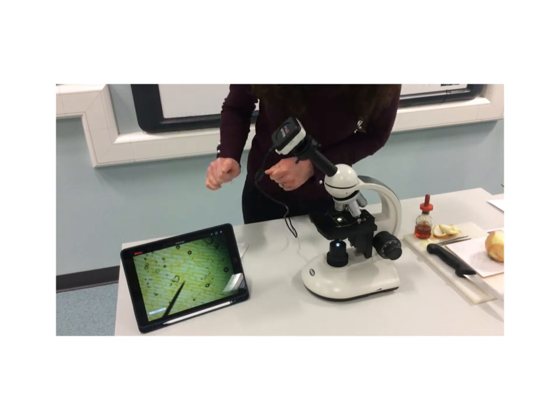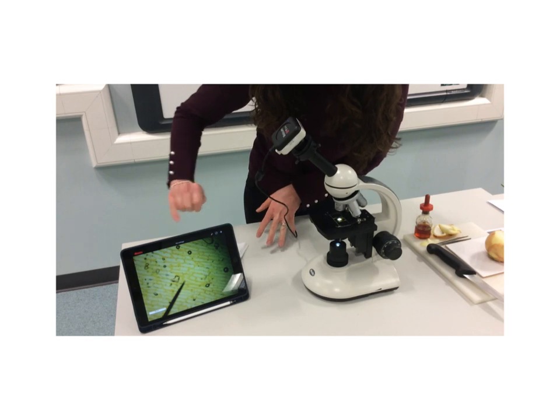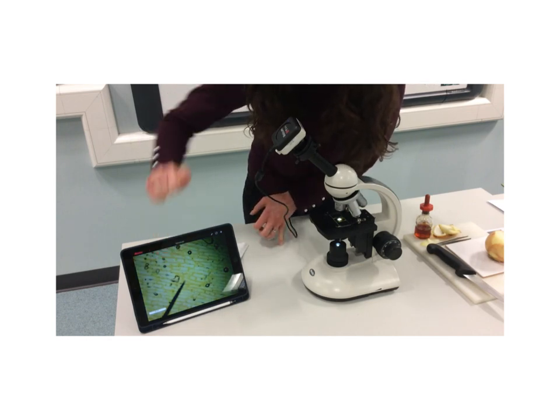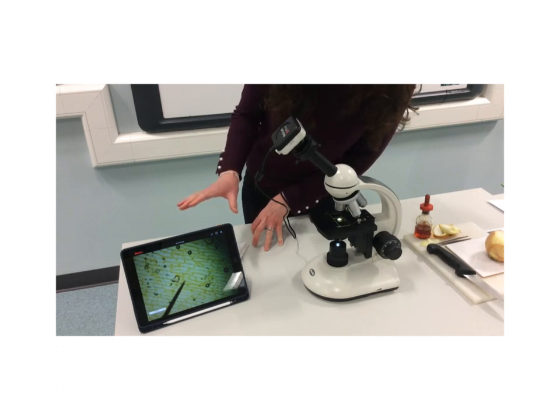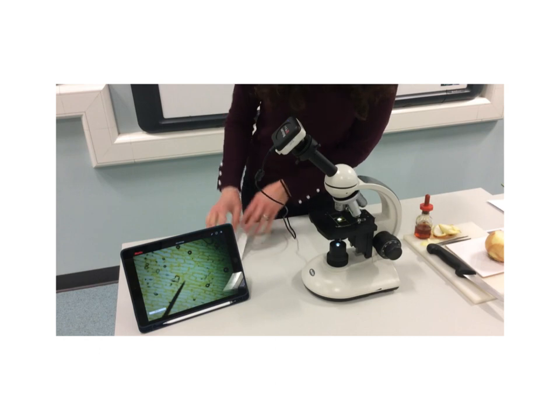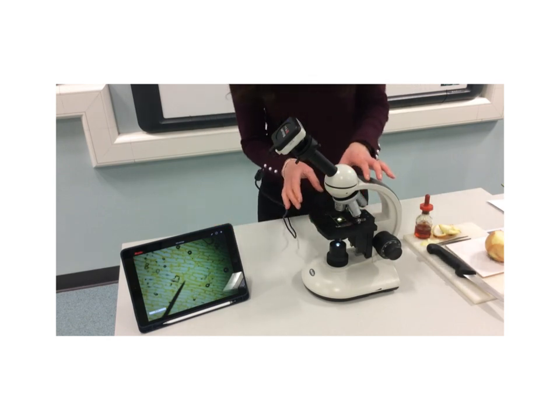This is what we call our cell wall. Now I want you to try and ignore these black circles because they are air bubbles, or the wee bubbles of our liquid, but I want you to see, can you see that slightly darker spot there? Okay, that's what we call the nucleus of our cell, and we can see that really clearly. Hopefully you can see it as well. So you can see that in most of the cells. Every cell will have a nucleus. It's like the control centre of the cell. Hopefully you can see that, and we'll look at those different parts in a later lesson.